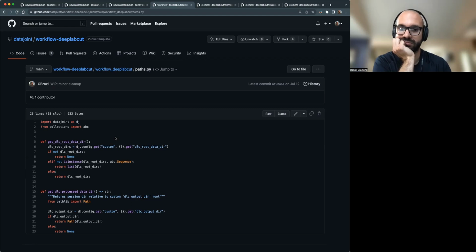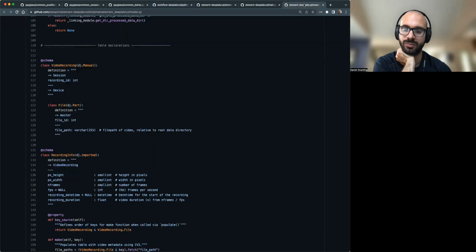no, that's not going to be a problem. I mean, you lose out on the benefit that every time it calls this, it expects a list. So you could give it multiple different places and therefore have multiple different root directories. But it seems like y'all have already figured that out and know where the root is going to be in all cases. So that's not anything to worry about overwriting, no. Okay.